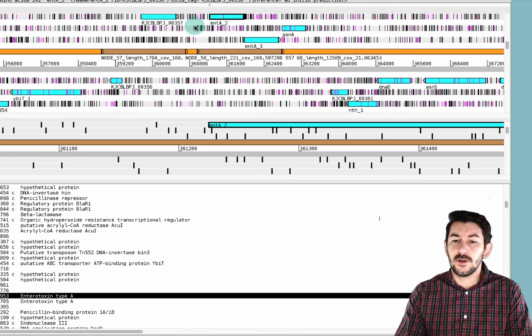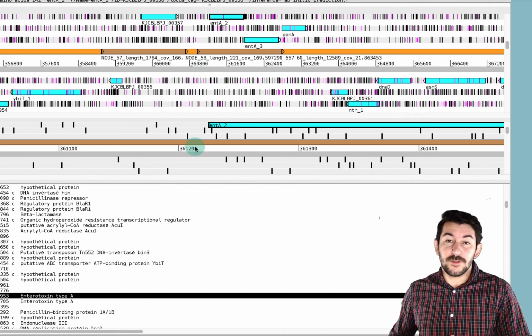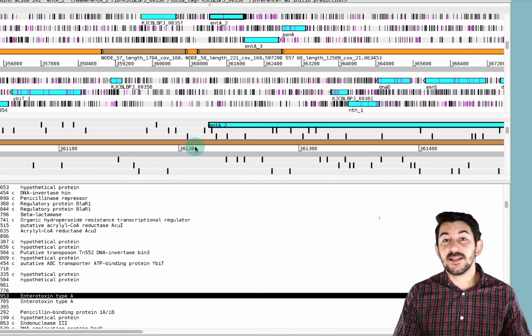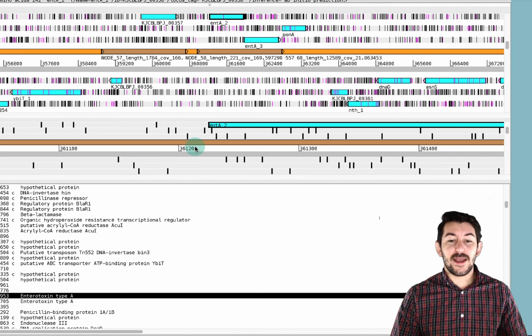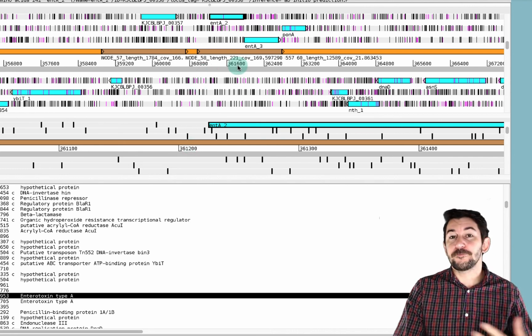So now we're getting to, we could sequence more of this bacteria and map it to this reference we just made and see which genes house SNPs, if we were working in a non-model organism. So now we have something that's actually a nice, important piece of information that can enable all sorts of experiments from this point forward. So hopefully you thought that was a little cool.